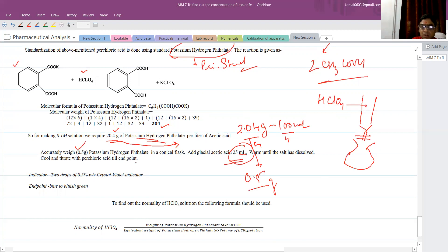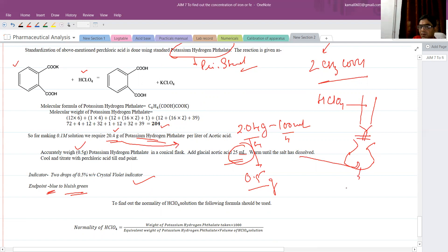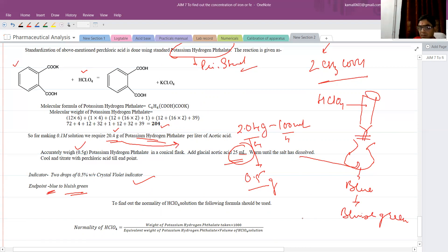Warm the solution until the solute dissolves, then cool and titrate with the perchloric acid solution until the endpoint. This solution is taken in a conical flask. The indicator used is crystal violet, prepared in glacial acetic acid solution. Initially the color is blue, which converts to bluish green at the endpoint.